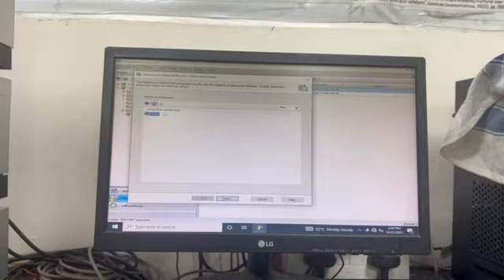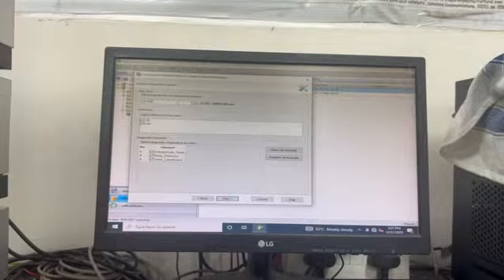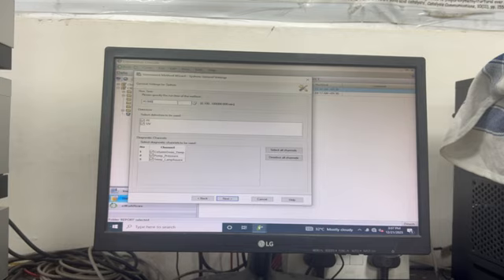In the instrument method, this is our HPLC, so we just have to click on next. Then there is a runtime here. Runtime is basically how long a single sequence, which means a single sample analysis, takes. That's the runtime. So how do we know this? Generally it's a trial-and-error process: we inject our sample and see at what retention time our peak is appearing, which takes a lot of time.